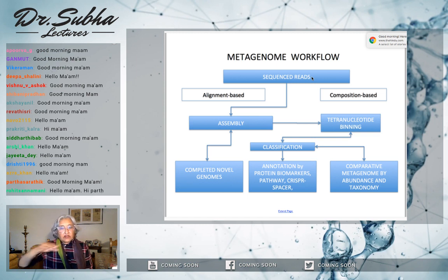They are not side by side as they are in the genome, because you don't know which genome each is coming from. When you're sequencing, you pull a fragment, sequence it, and call it sequence number 1. Pulling another fragment, sequencing it, calling it 2, calling it 3. So they're all coming one below the other in a FASTQ format. We talked about it yesterday. So when I'm talking about sequenced reads, I'm talking about a FASTQ file that we get from the sequencing.